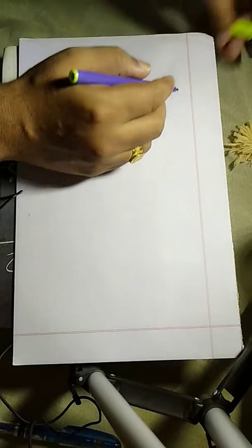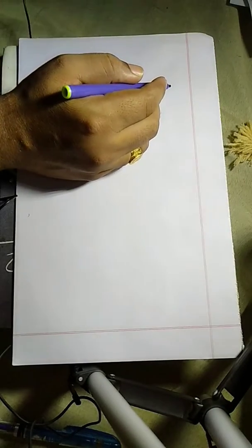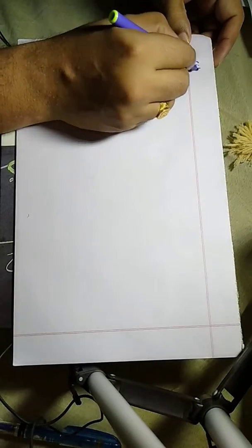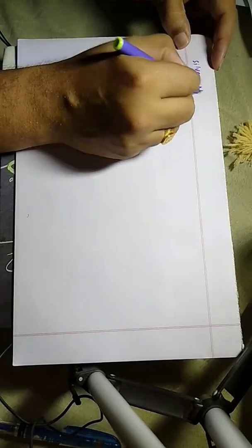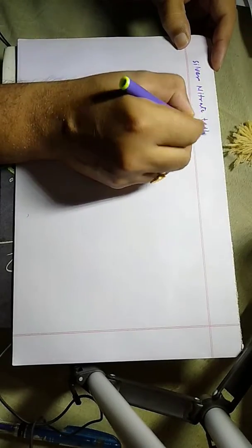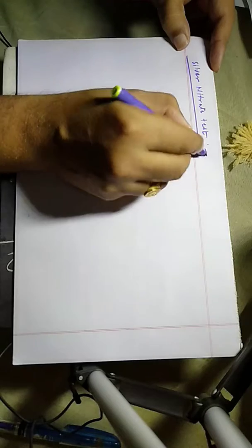Hello friend, today I am going to explain the silver nitrate test.